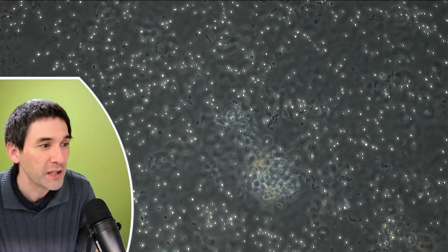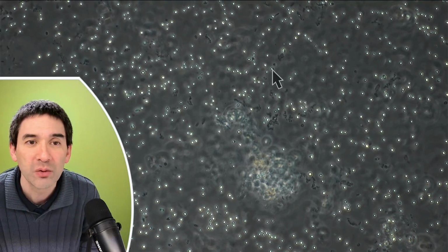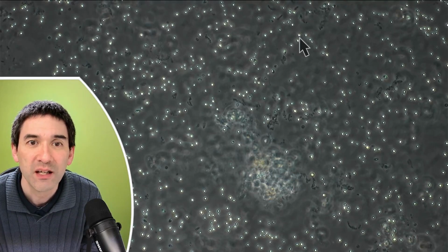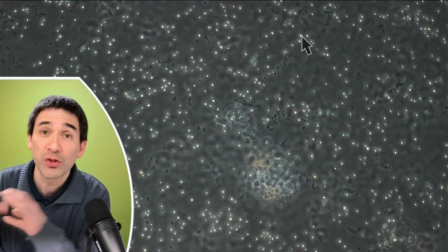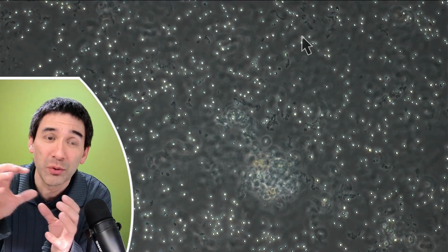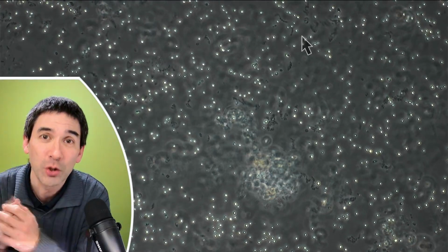I'm going to switch on the arrow right now, because I want to show you a couple of other things here as well. So if you look very carefully, then those tiny dots here, those cells, they vibrate randomly. And the reason is because they are surrounded by water, and the water has a temperature, and the water molecules are vibrating, and then they bump into those cells, and this causes the cells also to move around in a random manner. And that's called Brownian motion.